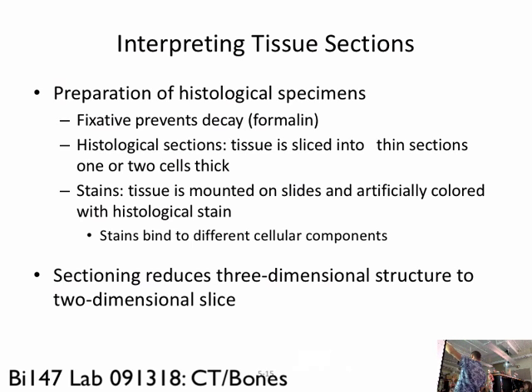And then they take that tissue that's been soaked in whatever they soaked it in, and they slice it up with something called a microtome. A super, super finely thin sliced piece of tissue, like thinner than paper, very thin. They put it on the glass, and they put the cover slip on it, and then they look at it.